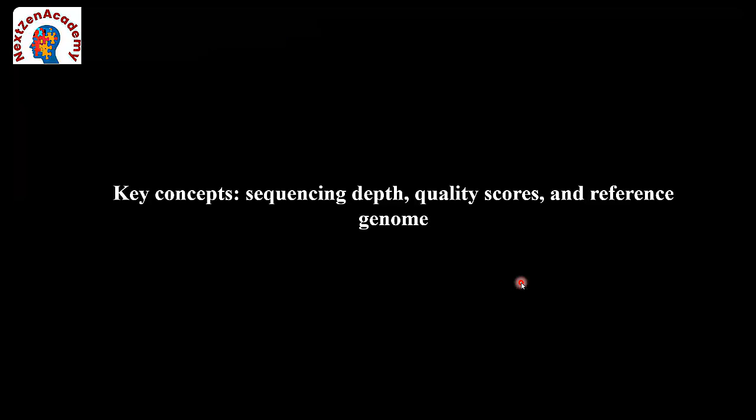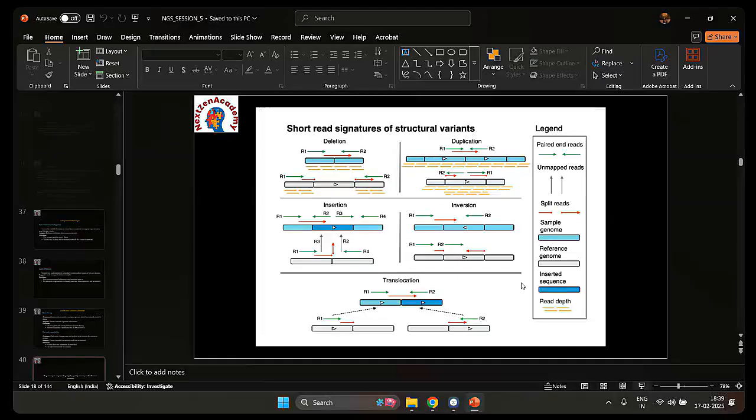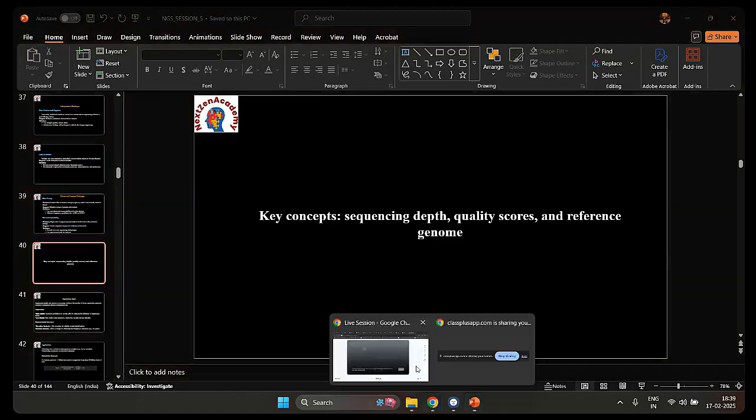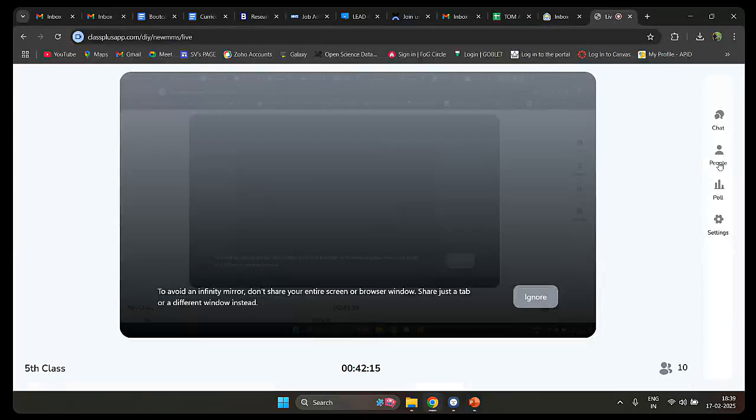So we need to use proper targeted depth sequencing for a specific region, rather than across all populations, when we are doing a population-based study. Another issue is lack of context: a variant may lack annotation details, for example if the website is slow or my internet is slow.